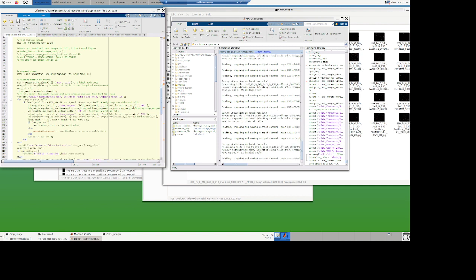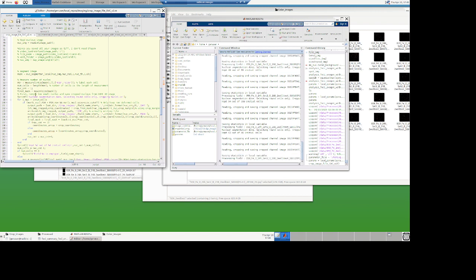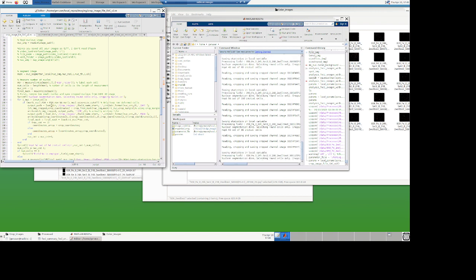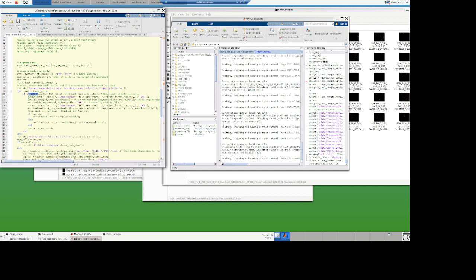And the way you read these measurements is you do a loop on the number of nuclei. So I look at the size of this array, which is the number of cells, the length of MSR, and then I do a loop on the number of nuclei, 1 to number of cells. And basically you can see here my filter: P2A mean has to be less than the cutoff, and the size has to be bigger than the cutoff.